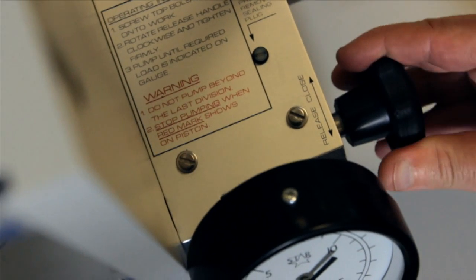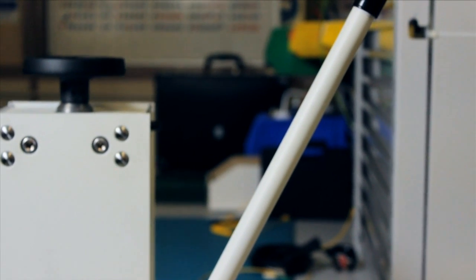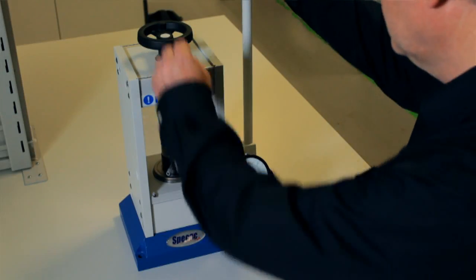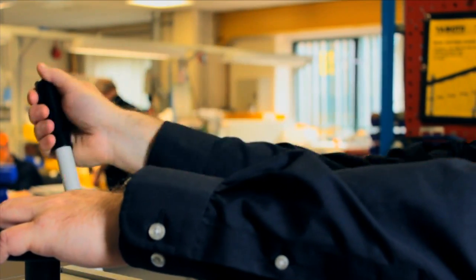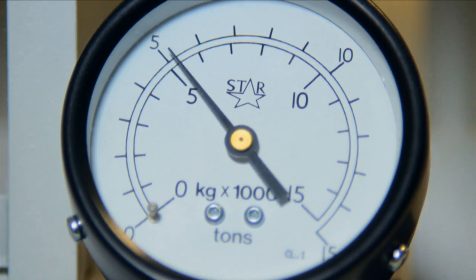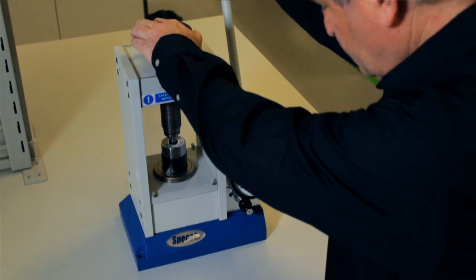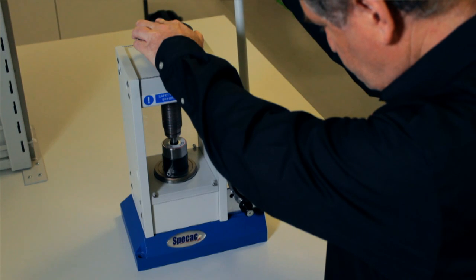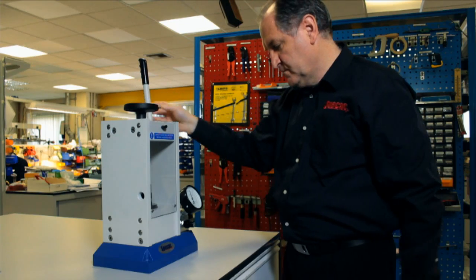Rotate the pressure release handle clockwise until it becomes firmly tightened. This closes the pumping system in readiness to build up an oil pressure in the system by hand pumping via the press handle grip. Ensure the front and rear safety guards are lowered and start to pump the press by pulling and pushing gently but smoothly on the pump handle. The correct leverage and force is applied by holding at the rubber handle grip. It may take a few hand pumps to build up pressure in the oil, but once resistance is offered by the work, a tonnage load will be indicated on the load gauge. Keep on pumping until the required tonnage load is achieved, then stop pumping.